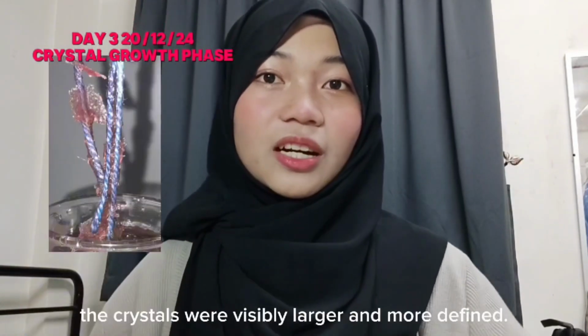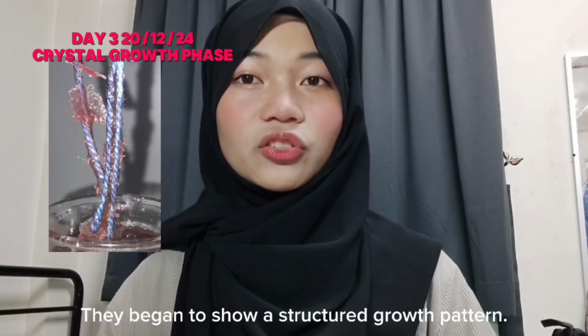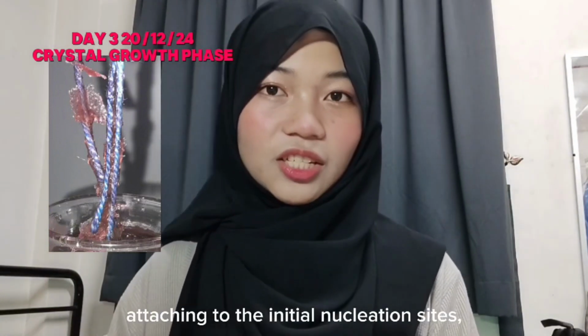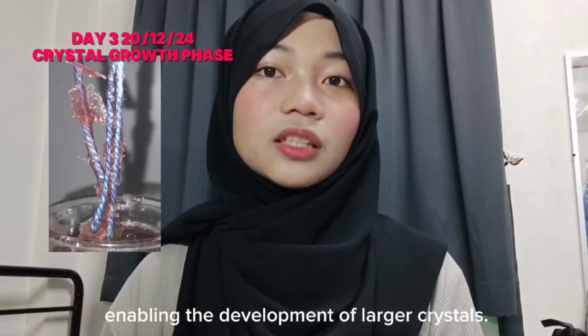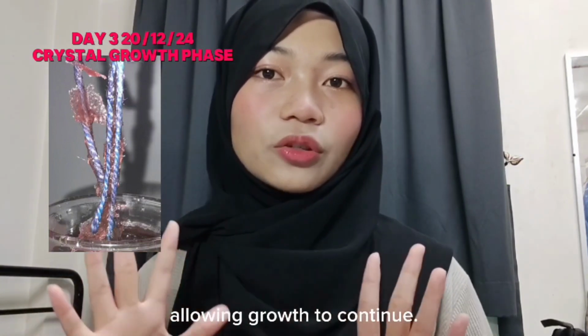Next, day 3, the crystals were visibly larger and more defined. They begin to show a structured growth pattern. Sugar molecules continued attaching to the initial nucleation sites, enabling the development of larger crystals. The solution remains saturated, allowing growth to continue.